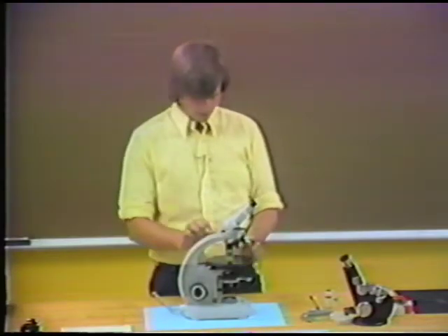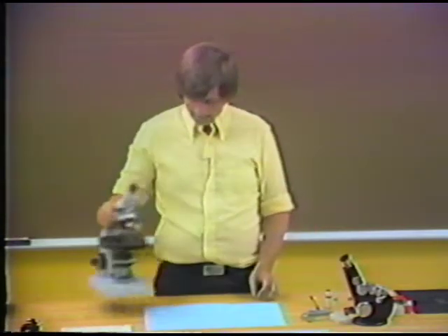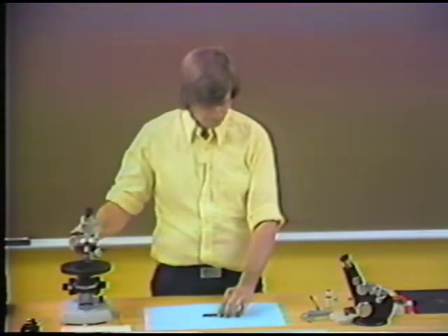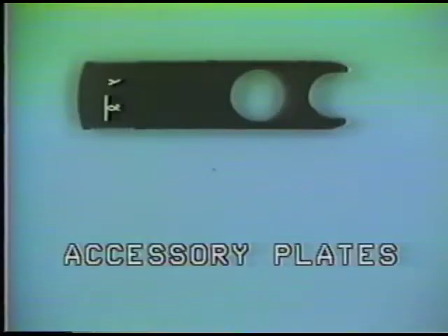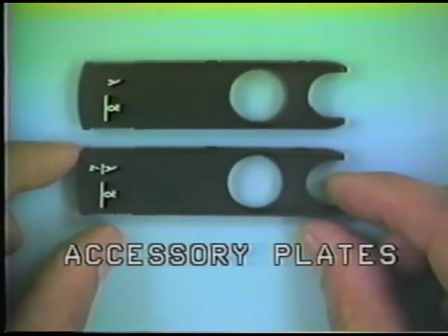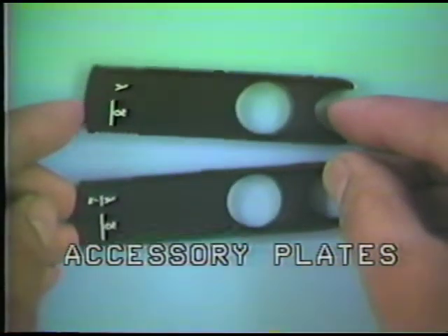Okay, next I want to talk about some special devices called accessory plates. And I have a few of these here to show you. There actually are three kinds of accessory plates. Two of them look very, very similar. These are the first two of these.